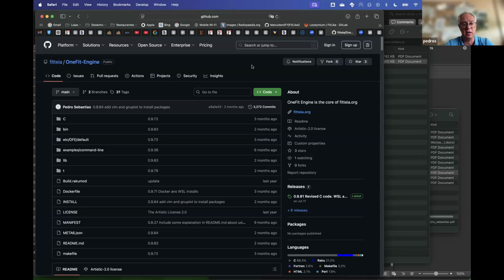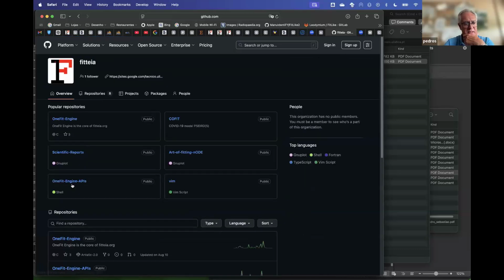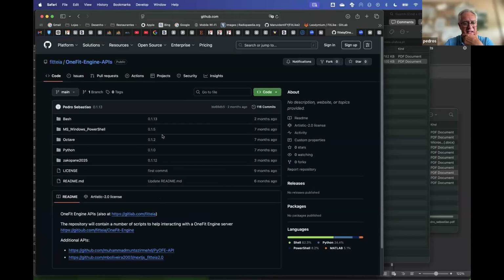Eventually, it will depend more on the freedom the user will have to write their own fitting functions, and on the number of functions that are included in the library of that particular fitting toolbox. That will define the extent of the use of that fitting engine. So the fitting engine is there. The APIs here are just testing APIs.